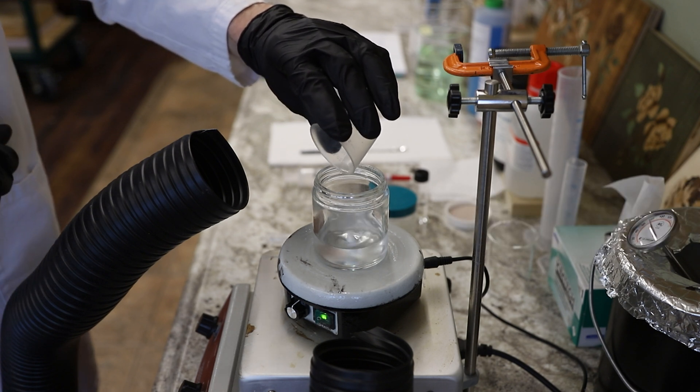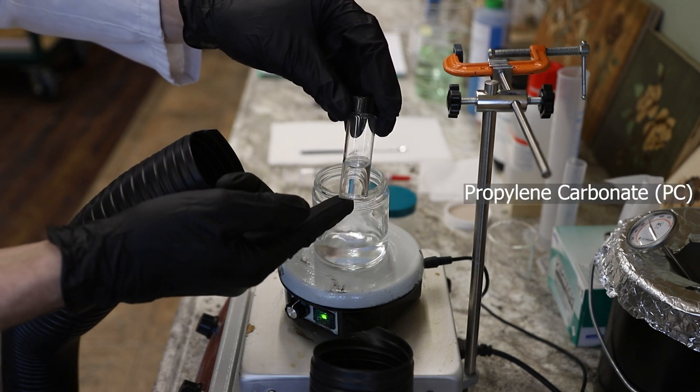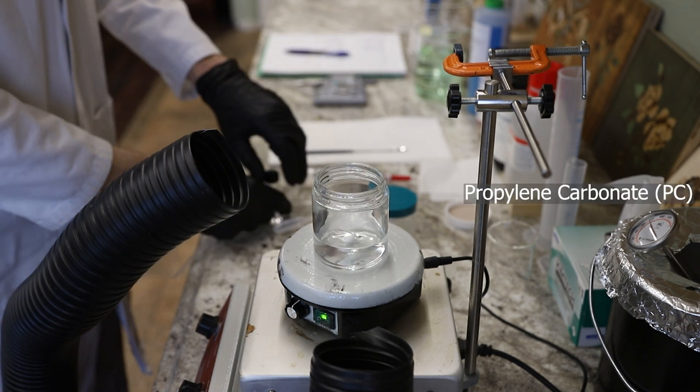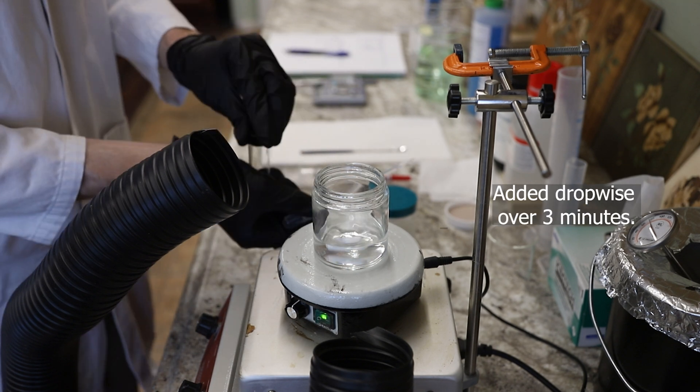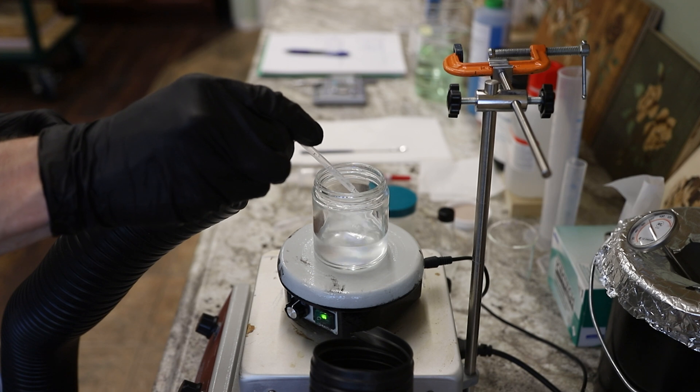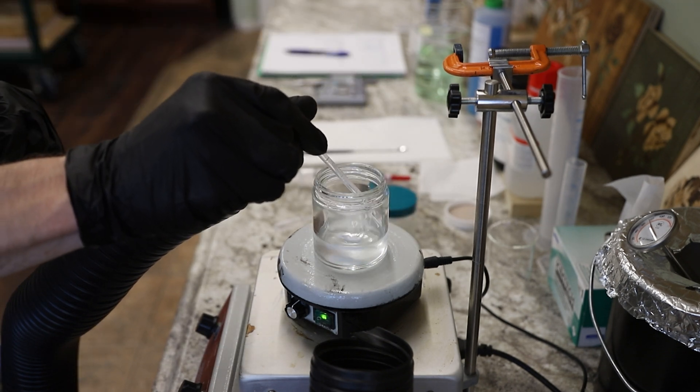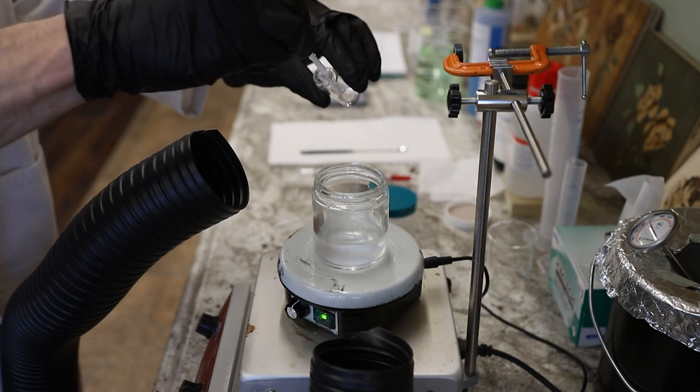So here I've added the EcoSurf EH6, which is my surfactant, and then I'm adding my propylene carbonate, which is the solvent. It's a hydrogen bond-accepting solvent, and I'm going to add it drop-wise over a period of several minutes. It's about one drop per second, and I watch the solution as I do it to see if it starts to get cloudy.